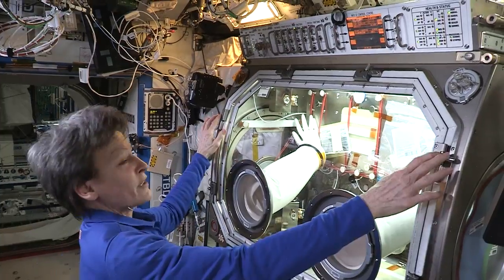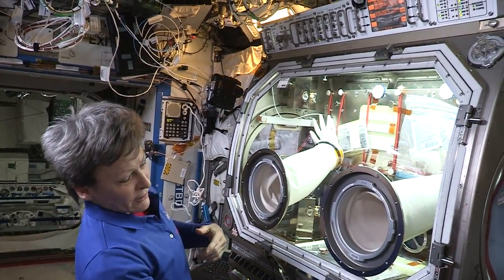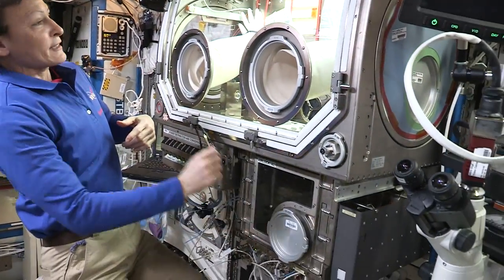It's very flexible and we can change out all the experiments by opening up this big door on the front. Once we've got the experiment set up inside, you can access it from the sides, or we have this little airlock down here that you could access from as well.